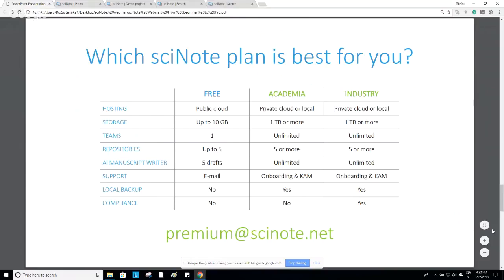Okay. So now we have another question. Daniel, thank you for your question. Are these features available for purchase? SciNote Manuscript Writer and 21 CFR Part 11, if we install locally via your GitHub free version?